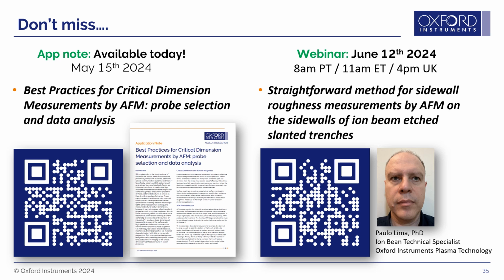Being able to image in tapping mode is preferable specifically for these high or deep features. In terms of surface roughness images, we also tend to image in tapping mode, just because we want to preserve the tip sharpness, which is important for these types of measurements.